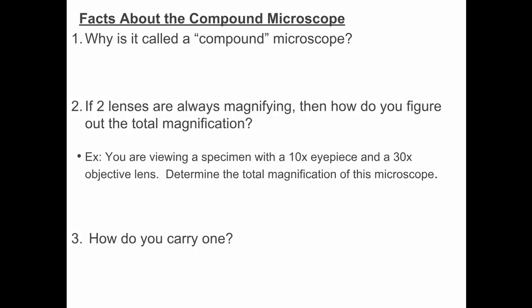Today is some of the details about how we use a compound microscope and how we determine its magnification, how we can estimate the size of objects using the compound microscope, as well as some terminology related to it. So let's try and get through some of those things today.